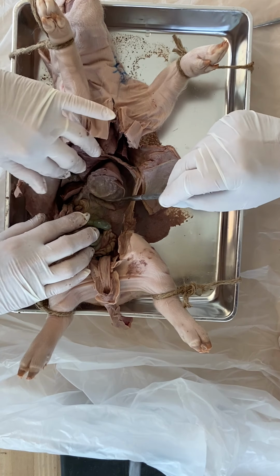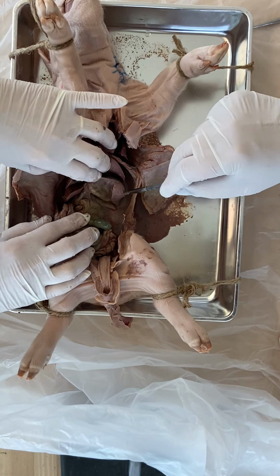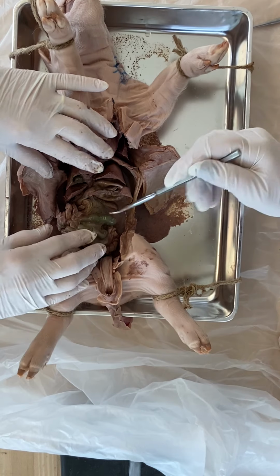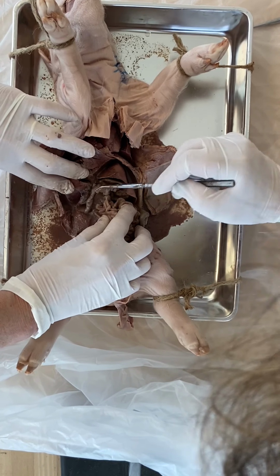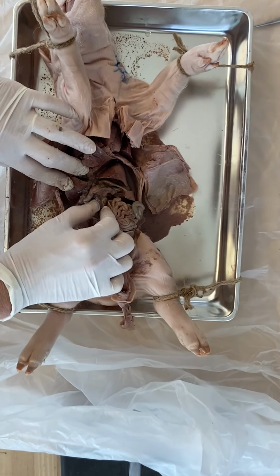This is the stomach, and this bag looks very flimsy, but has muscular walls. And this is the spleen that is coming around here. We didn't mention the spleen. So there is the stomach feeding into the top of the small intestine.